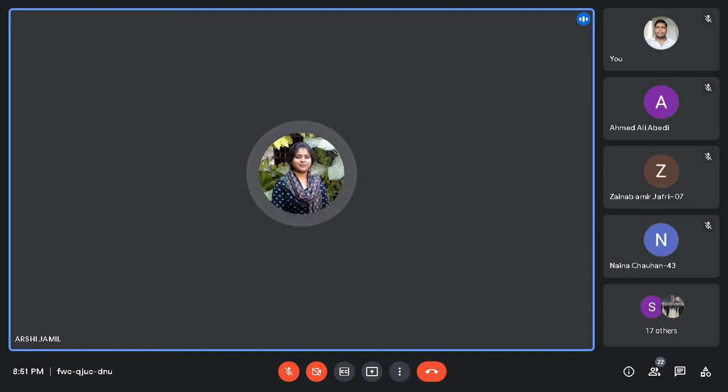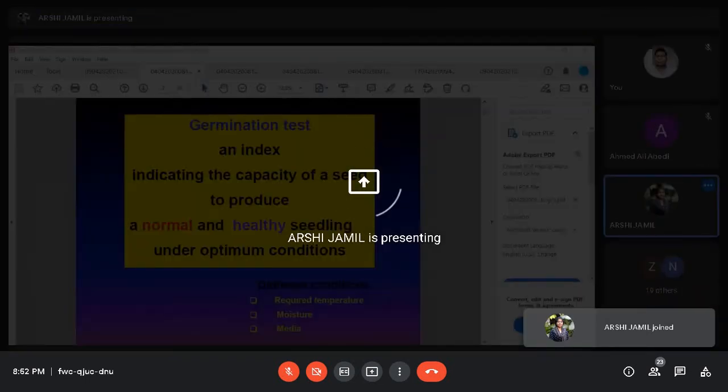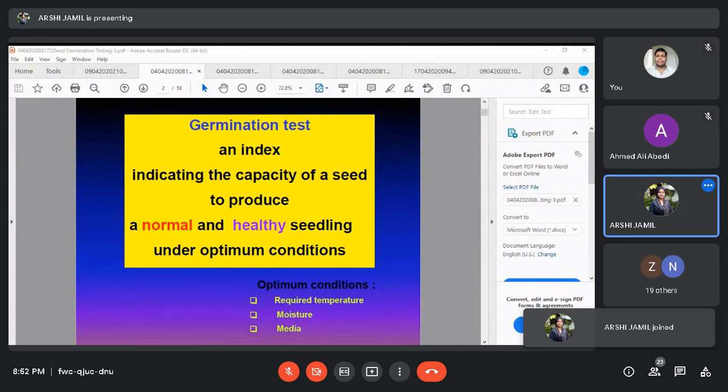Okay, we have learned about sampling, then we have learned about physical purity. Now coming to the germination test, the seed germination test. So what is germination? I'm sharing the screen again. Now can you see it on the screen?